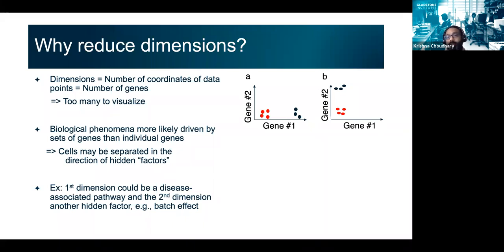For example, reducing dimensions may lead to denoising of the data. It may serve that goal, but also perhaps increase the computational efficiency for some of our steps. So there are various goals, including, as I mentioned, denoising, computational efficiency, and data visualization. These are some of the goals for reducing the dimensions from 20,000 to fewer.